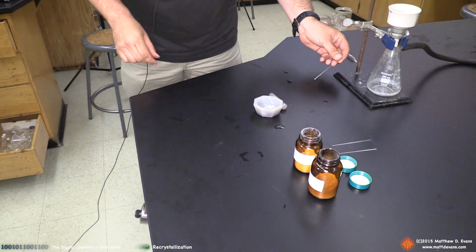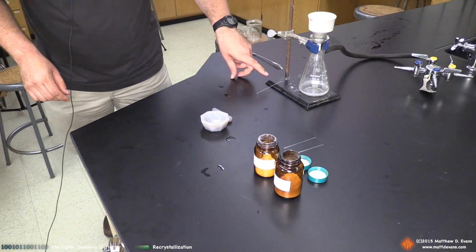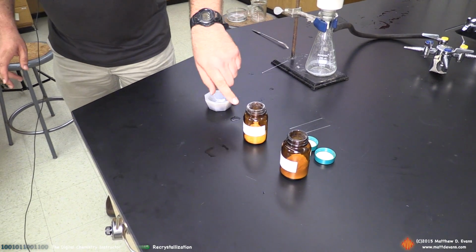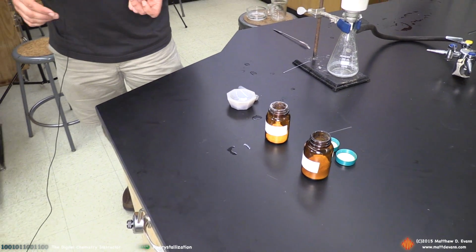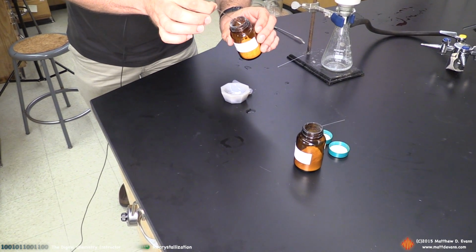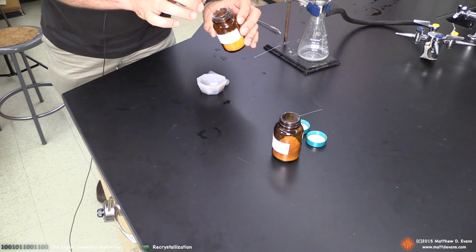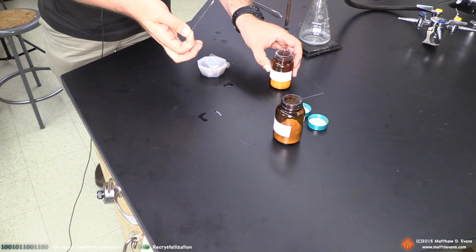So I'm going to eventually put that into the melting point apparatus, but I need to keep track of which one's which. This is the one that I just recrystallized. I also want to run side by side with this recrystallized sample, I'm going to run impure sulfanilamide. So this is the original solid that we purified, and I want to see what the melting point difference is between impure and pure. Got too much in there this time. This one's really tough to get a small amount. That should do it.